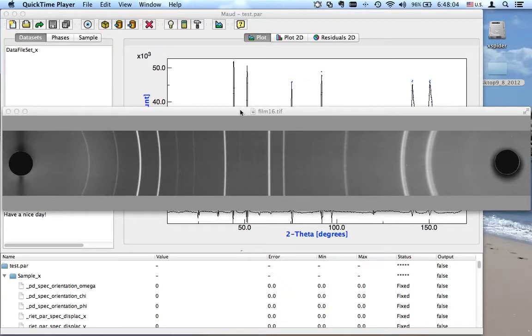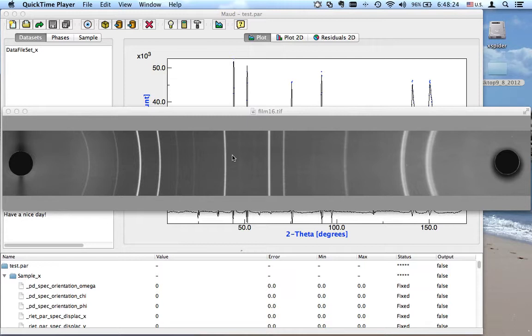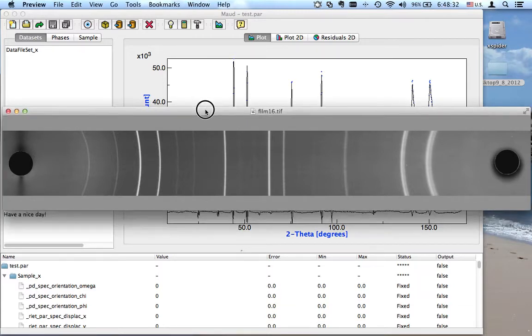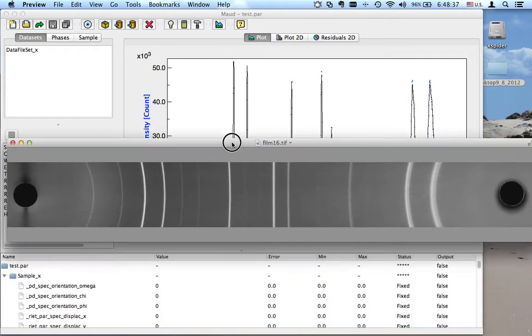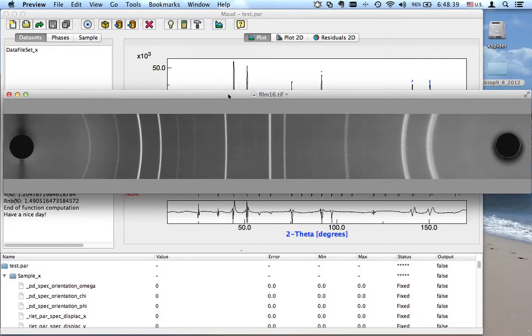Integrating images. The image we will use this time is an image coming from a Debye-Scherrer camera, an old one, collecting the intensity on a film. The film was just passed through a scanner. We will need several corrections and we will see how we can integrate following the circle and get a nice pattern, sufficiently nice to be fitted. This is a nickel-three-aluminum sample.